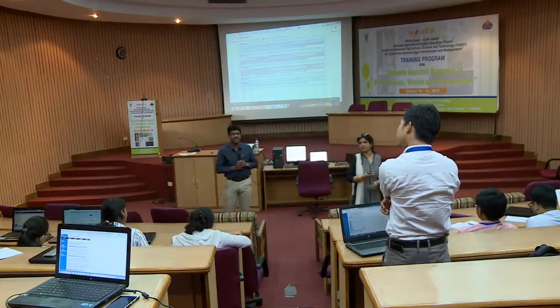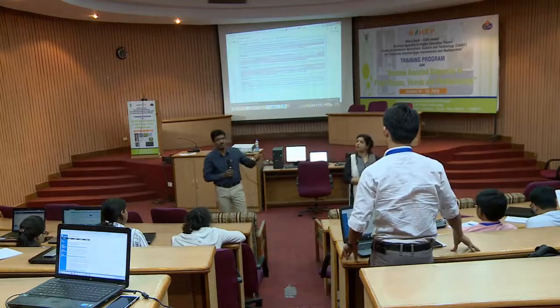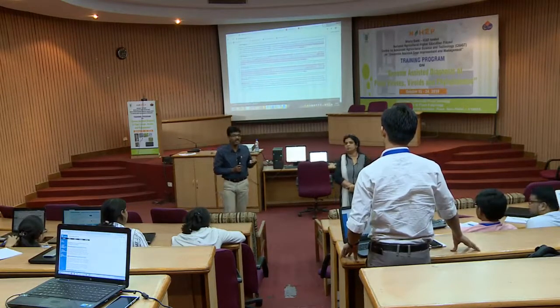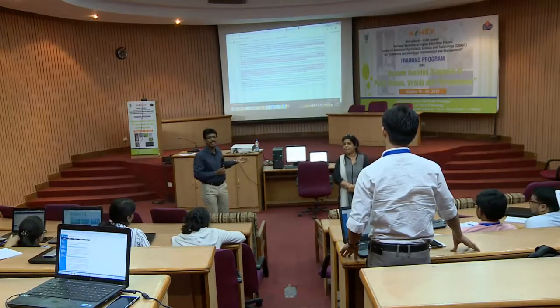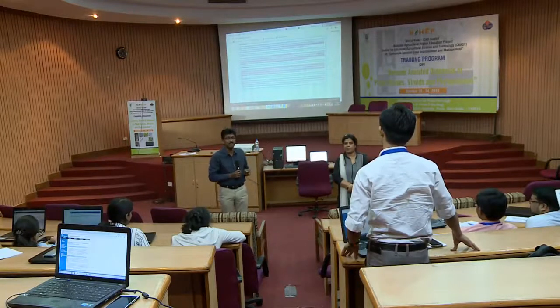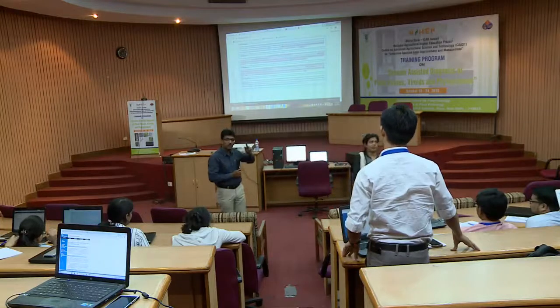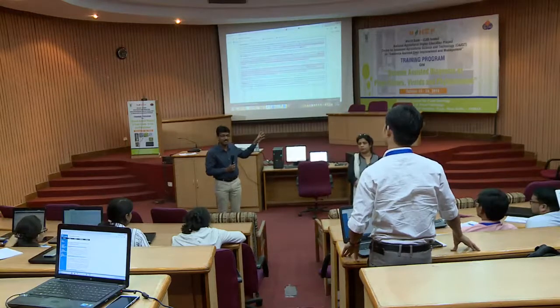And there is a saying about sequence generation from an organism whose phenotype is not well characterized. Technically, you cannot upload that data in GenBank, right? When you do the flat file making, what name will you give? Genus name and species name if it is a cellular organism. Maybe it's true with viruses also. You have to give the correct phenotypic information in the data sheet, right? These two should match. Why? Because your mistakes will amplify with time and space.